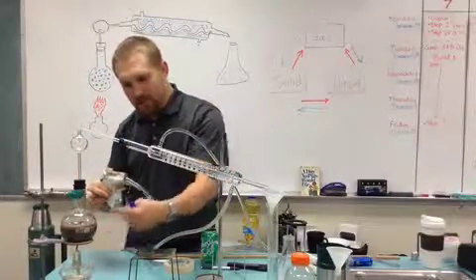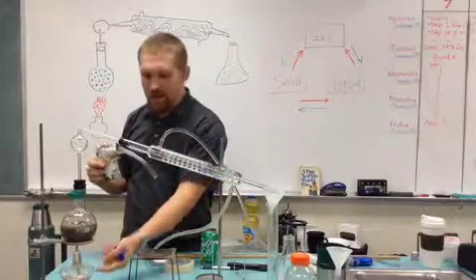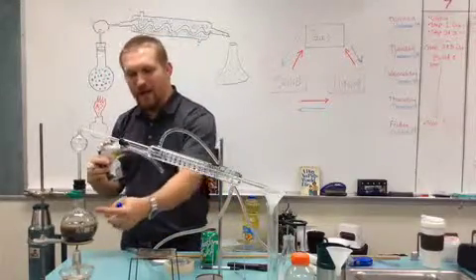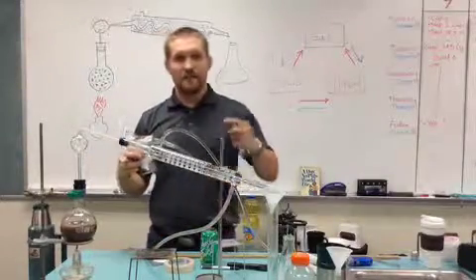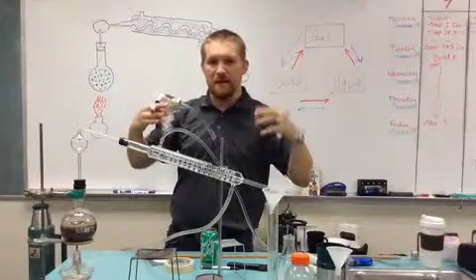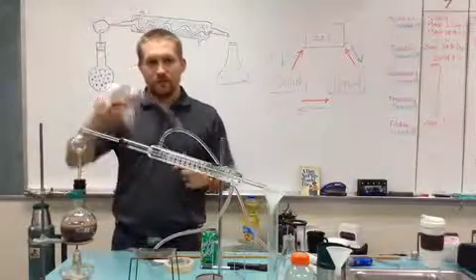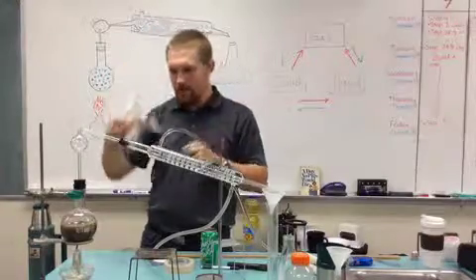What we can see here, this is called a boiling flask. And you guys used a hot plate, but instead of using a hot plate, I'm actually using a little burner. Okay? So this burner is heating up my solution of dirty water. Again, a solution is something where it's made out of different particles and they're evenly spaced. They're evenly separated. So my burner is heating up my solution of dirty water. Just like in here, your hot plate heated up a solution of salt water.